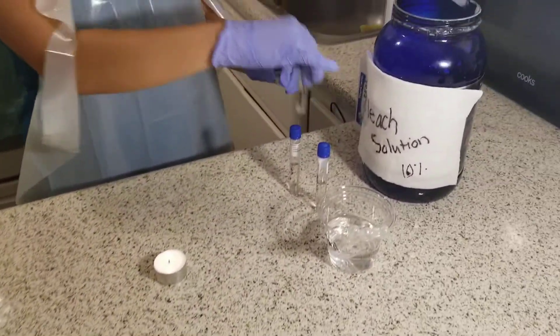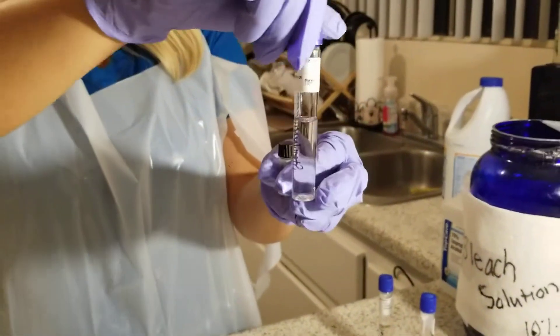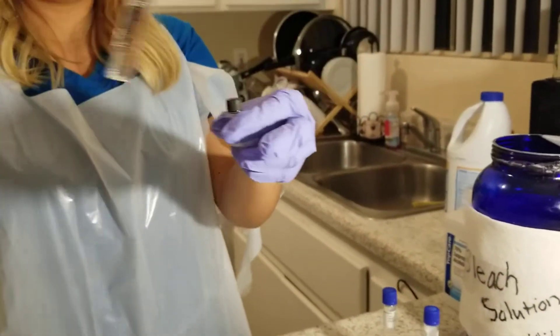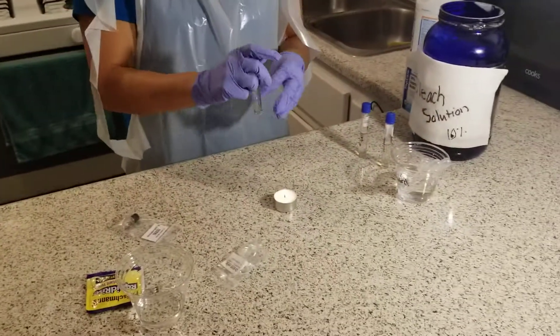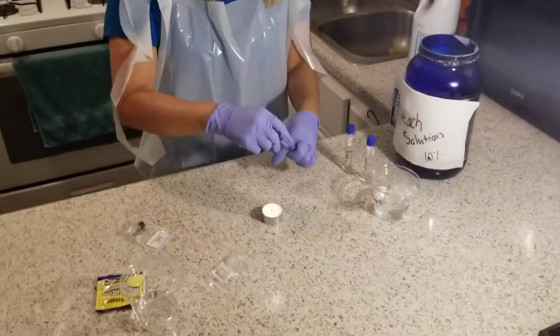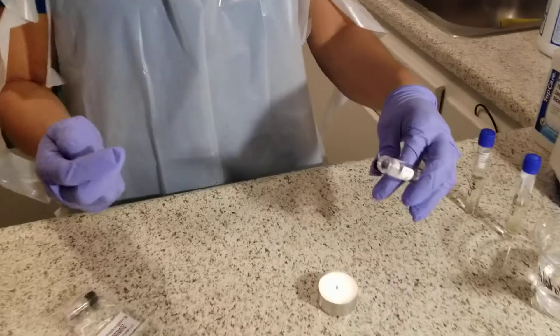I'm going to get the nutrient broth that's labeled with the Staphylococcus, and then I have the culture. What I'm going to do first is have the nutrient broth, and it's important to hold it at an angle because there's microbes everywhere.